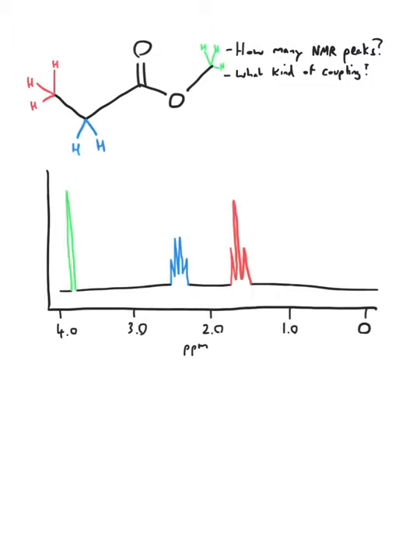And here is the spectrum. As we can see, the methyl bonded to the oxygen appears as a singlet because there are no protons to couple with. However, the protons in the two environments of the ethyl group appear split because they are coupled. The protons on the terminal carbon appear as a triplet, and the protons on the secondary carbon appear as a quartet, as they are being split by 3 protons.